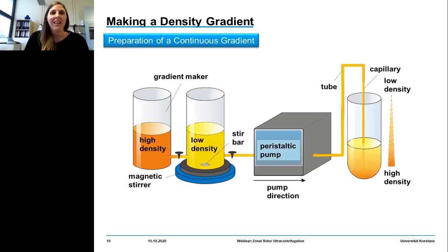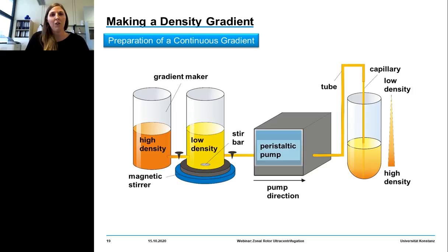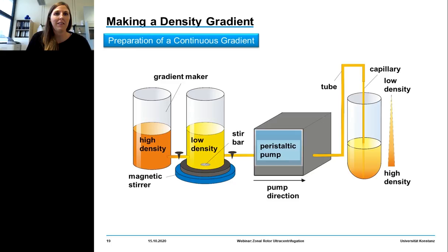The traditional way of constructing a continuous gradient is to use a two-chamber gradient maker — here a simple model with two identical chambers connected by a tapped channel, where the mixing chamber has an outlet. The device is set up with the mixing chamber on a magnetic stirrer with the outlet tube leading via a peristaltic pump to the bottom of a centrifuge tube. The high-density solution is filled in the left chamber and the low-density solution in the mixing chamber.